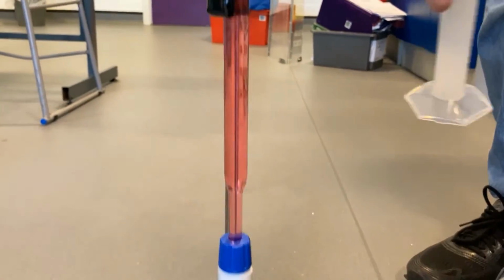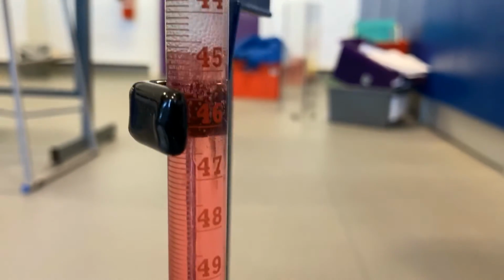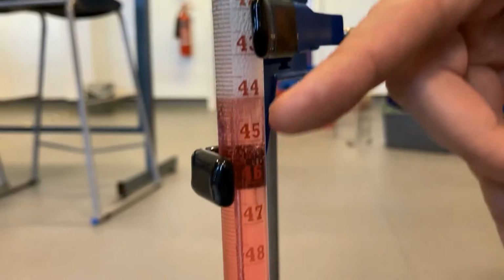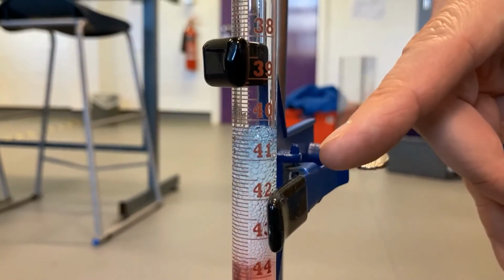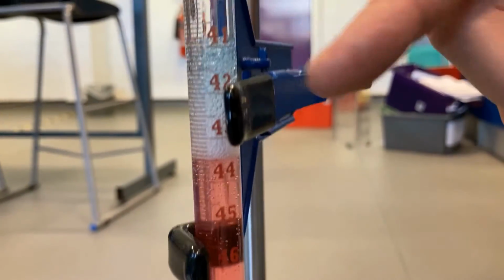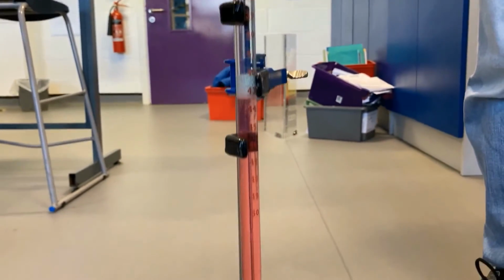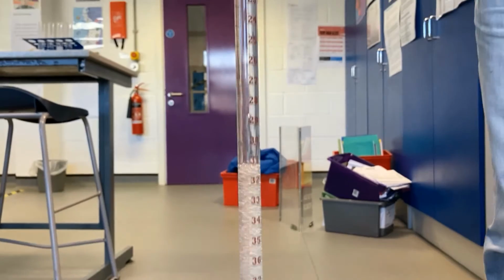And oh, you can see the colours. Can you see the blue there? The blue there showing us it's alkali. So we've got a slight range of things there. We have got acids and alkalis, and somewhere in the middle here, we've got something slightly greeny. Let's put some more in. Right, add some more, and we're off again.